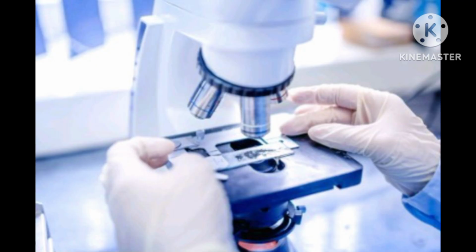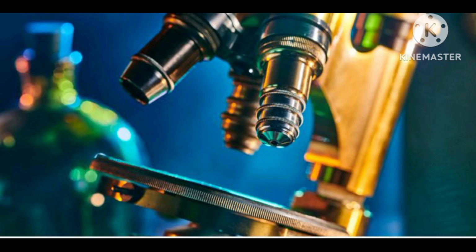The third part of a microscope is the base. The base is the lowermost part of the microscope that supports the entire microscope structure. It provides stability for the microscope. Illuminators, light switches, and the electrical wiring system are fitted in the base.